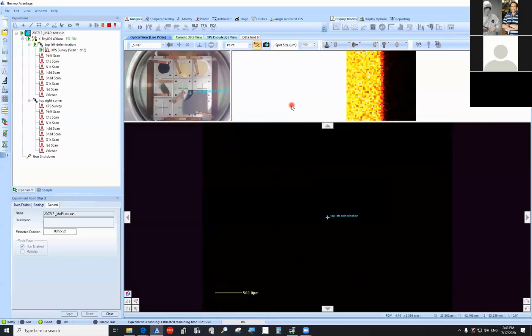So remember that little mantra, and that's how you put them together. And once you define a specific experiment and the data you collect provides the answers you need for the next step in your research, the basic idea is to come back and use the same experiment over and over again with just updated positions.